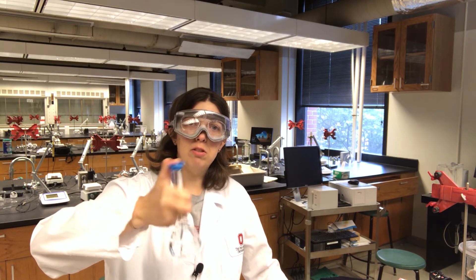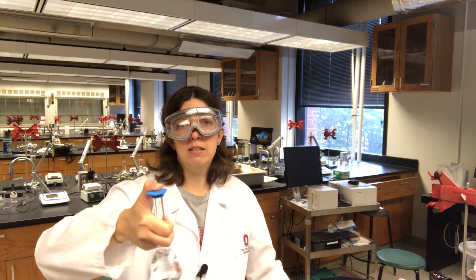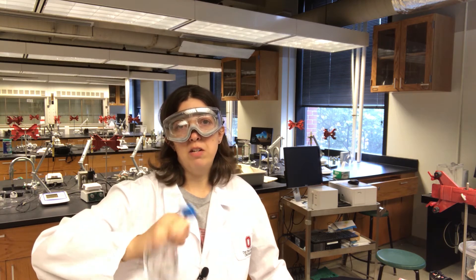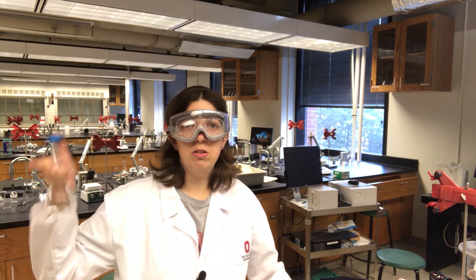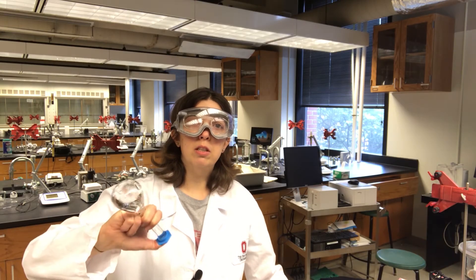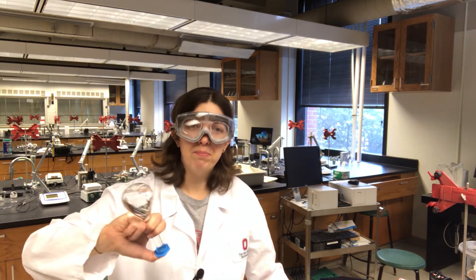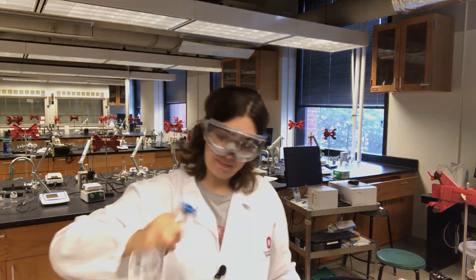I'm going to take 50 milliliters from this flask, add it to another 100 milliliter volumetric flask, add 1 mil of ISA, and then dilute to the line with water. When I transfer 50 milliliters from this flask to the next flask, effectively I'm transferring 1 mil of ISA, and so by adding 1 more milliliter to the next flask, I have in total 2 milliliters of ISA. That's an easy way to get to 2% ISA in your subsequent solutions.